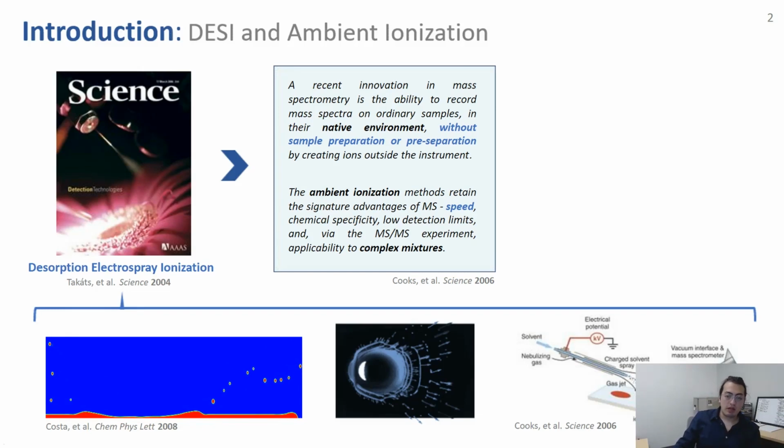What does this mean? Well, this means that you can perform analysis of samples directly in the open air with no or very minimal sample preparation. You don't have to do ionization in vacuum, and you retain, of course, all the capabilities of MS without having to have your ionization happening through, for example, lines of solvent going around or happening inside a vacuum chamber using a laser, for example.